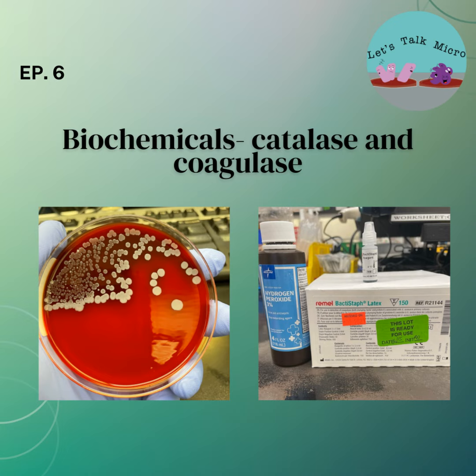So in today's episode, we are going to be talking about biochemicals. What do we use them for? Well, it's one of the tools we use for identifying our organisms. So at this point in time, you are an expert microscopist. You know how to read and report a gram stain, either blood culture or regular gram stain. Your organisms have been plated in the media that we talked about, and they've been incubated, right? So now they're ready for us to take a look at.